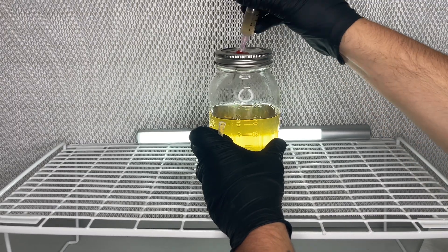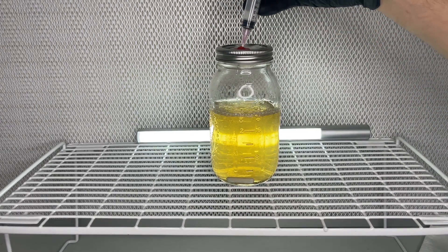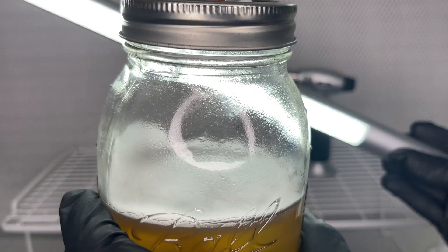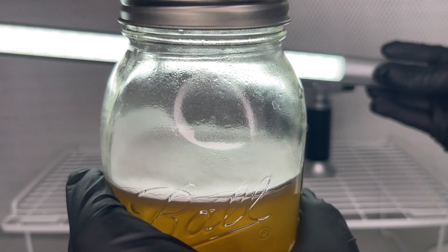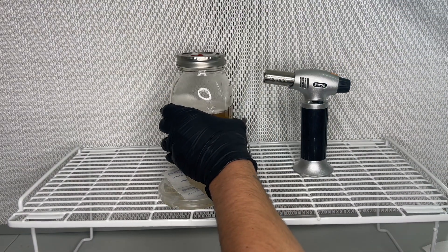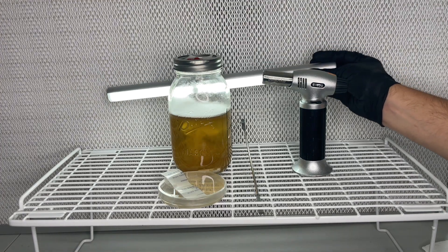Using the same syringe that I tested on agar, I inoculate a jar of sterilized honey water. Now if you let the jar grow for about one month without stirring or disturbing the jar, the mycelium will start growing on the surface and eventually start growing up the side of the glass.